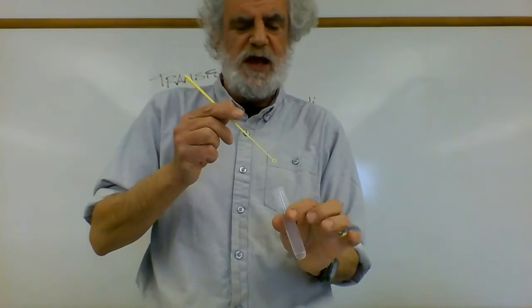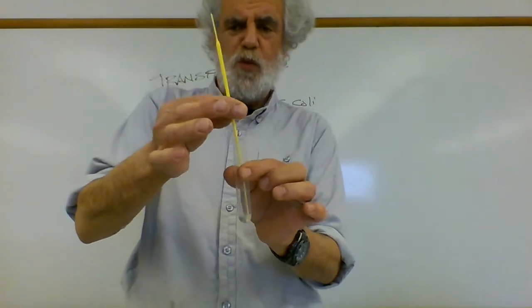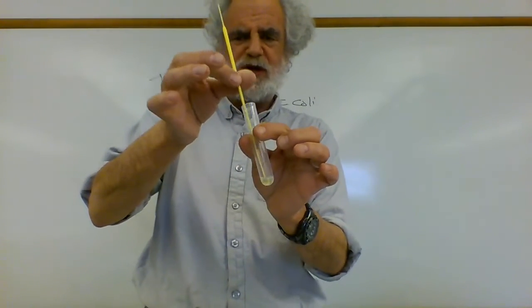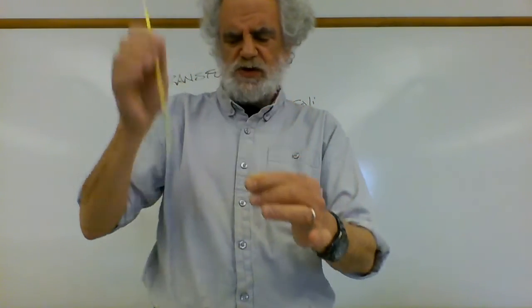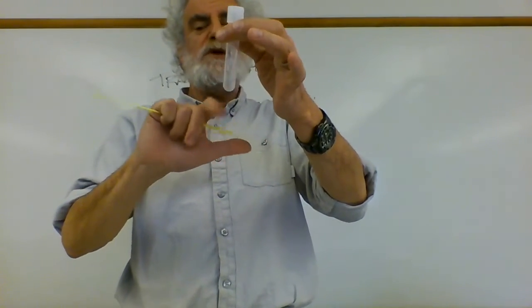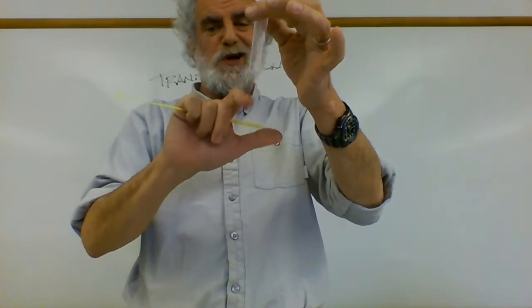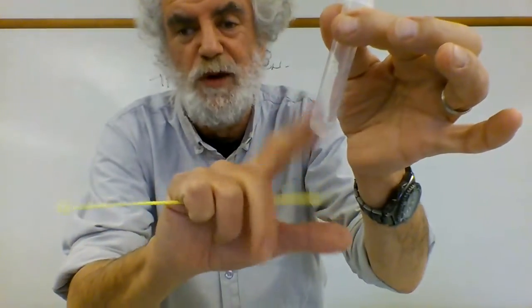These are twist-offs. You drop it in there, and then using your thumb and forefinger, spin it betwixt your fingers to dislodge that bacteria. You can then use a micropipette to pipette up and down. You don't want to beat them too hard, but you do want to disperse them so they're not a clump. There's a bit of a clump in there, but this is for demo purposes only.